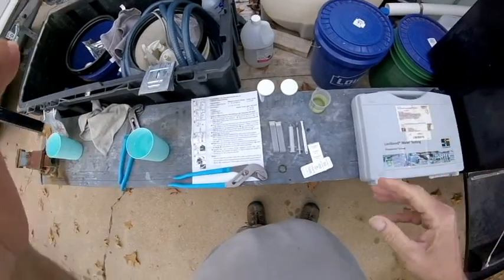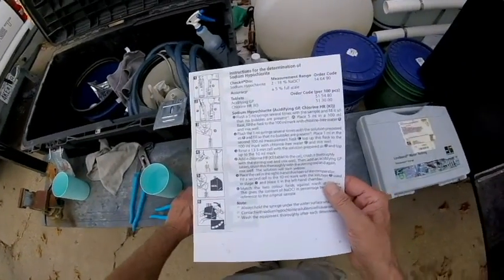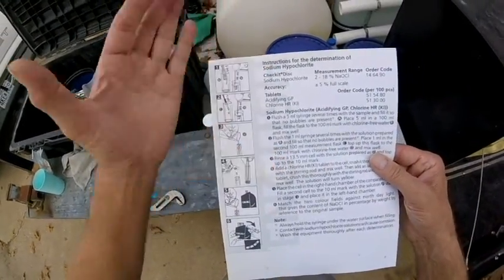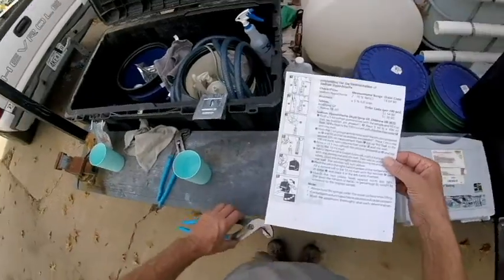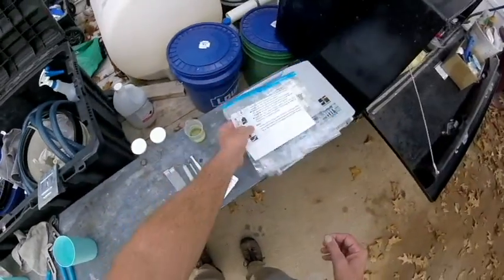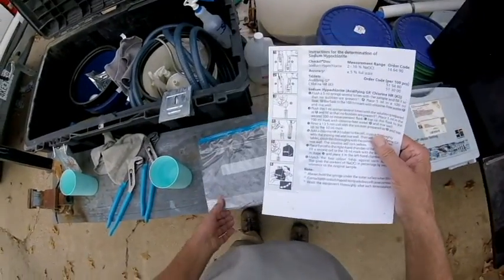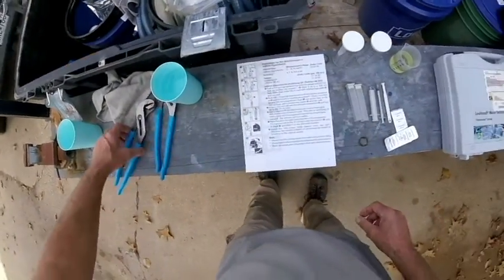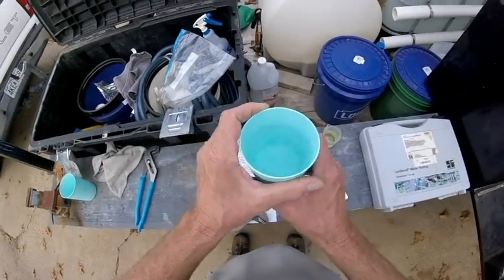The first thing I want to tell you guys to do is print off your instructions from the Lovibond website. Print them off because the ones that come with the kit are really tiny, and with my old eyes I can hardly see them. So print off a big sheet of paper — two or three of them. I just carry these in a ziploc bag. For a while when I was testing all the time I had all this memorized, but it is quite a little project.